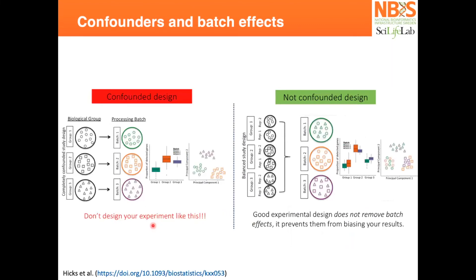A confounded design is when you have biological groups one, two, and three, and process them separately — batch one, batch two, batch three — or use different single cell methodologies for each one. That gives you wrong results because the differences you see will be due to technological or batch differences, not biology. What you want is to mix your different groups into different batches, with one sample from each group processed together, so all groups are in one batch. This non-confounded experimental design is the best way to avoid batch effects, so if you plan your experiment beforehand, this is the best approach.